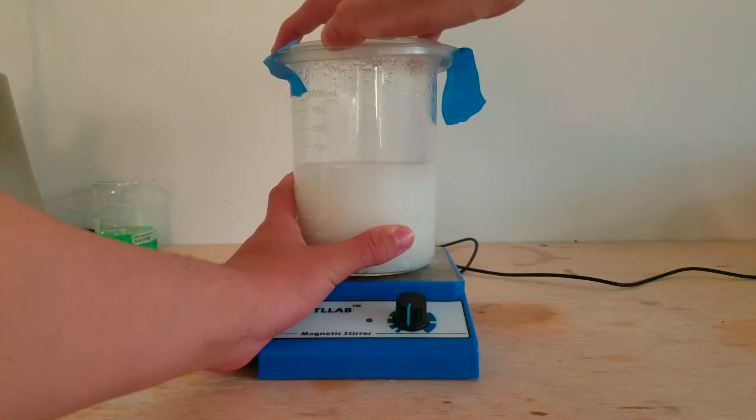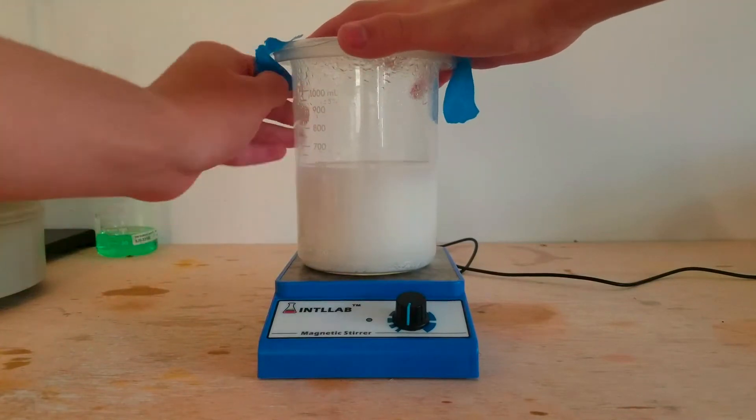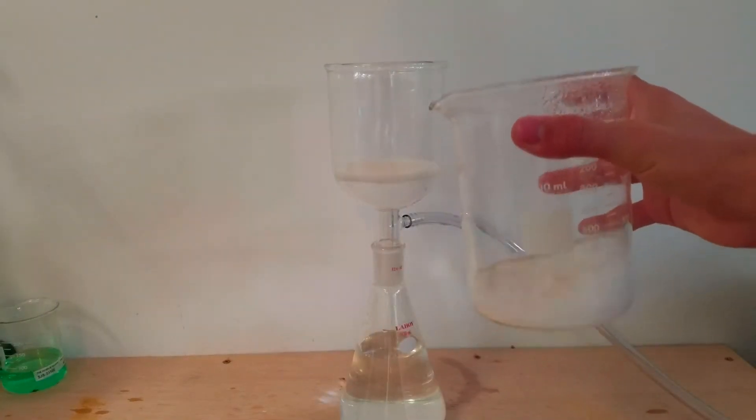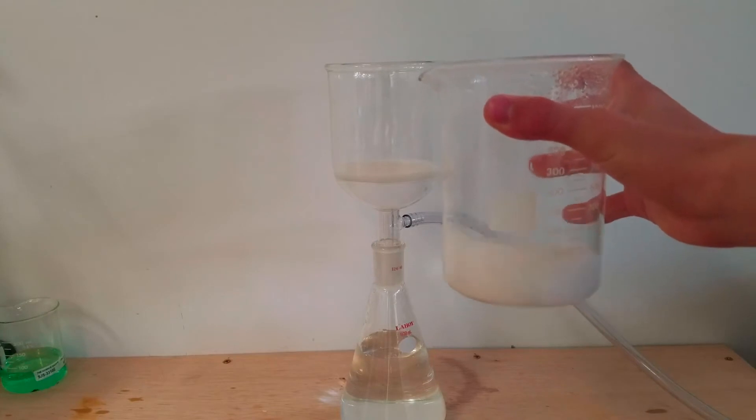I decided that the next step would be to try to filter off the bismuth oxychloride and dry it. Unfortunately, I had too much mixture to filter it off in one go, so I had to do two vacuum filtrations.